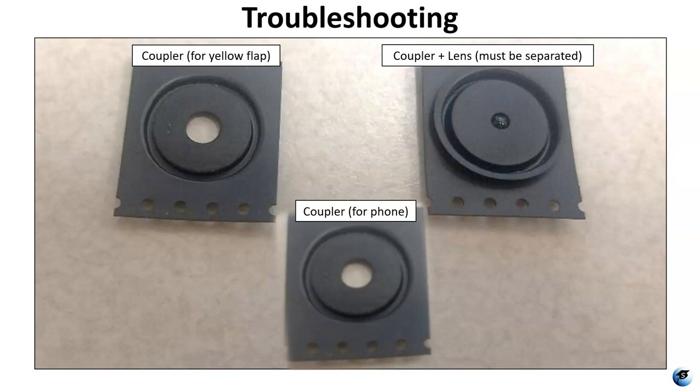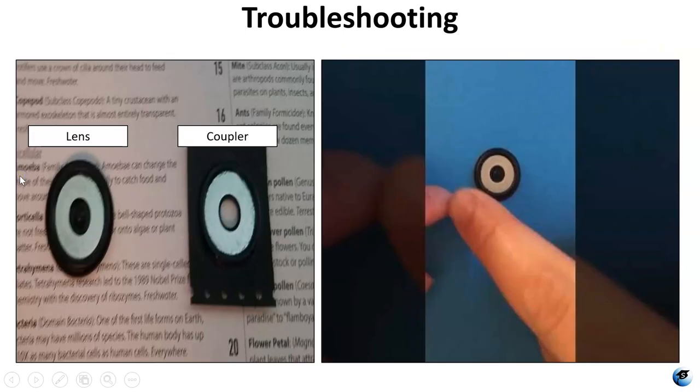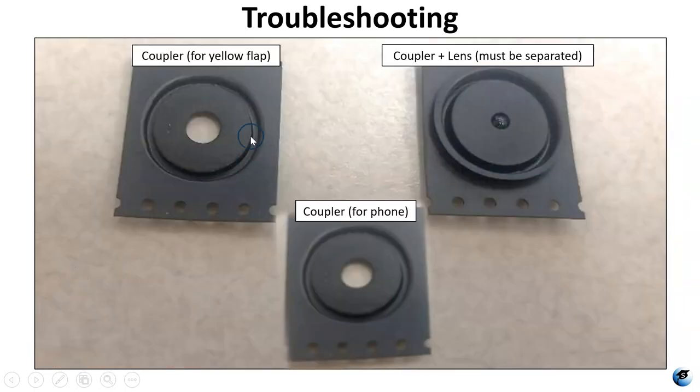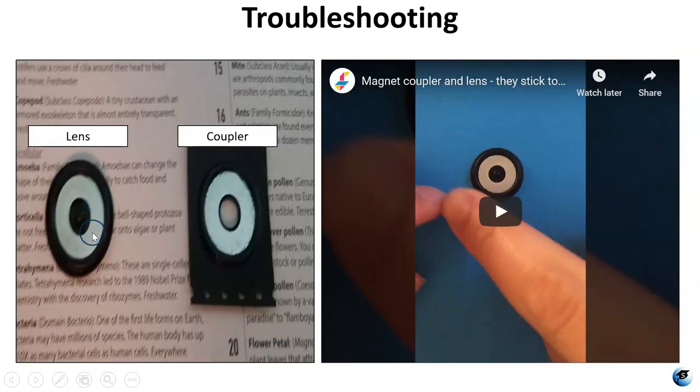The coupler is magnetic so they're magnetically stuck to each other, but they're not supposed to be like that. You can actually take the lens right off the coupler, and that will give you three couplers. You'll have a coupler that goes into the yellow flap, a coupler you can attach to your phone, and a coupler that will be attached to the lens — except you want the coupler on the front blue side and the lens on the back yellow side, so your lens is actually held in place.